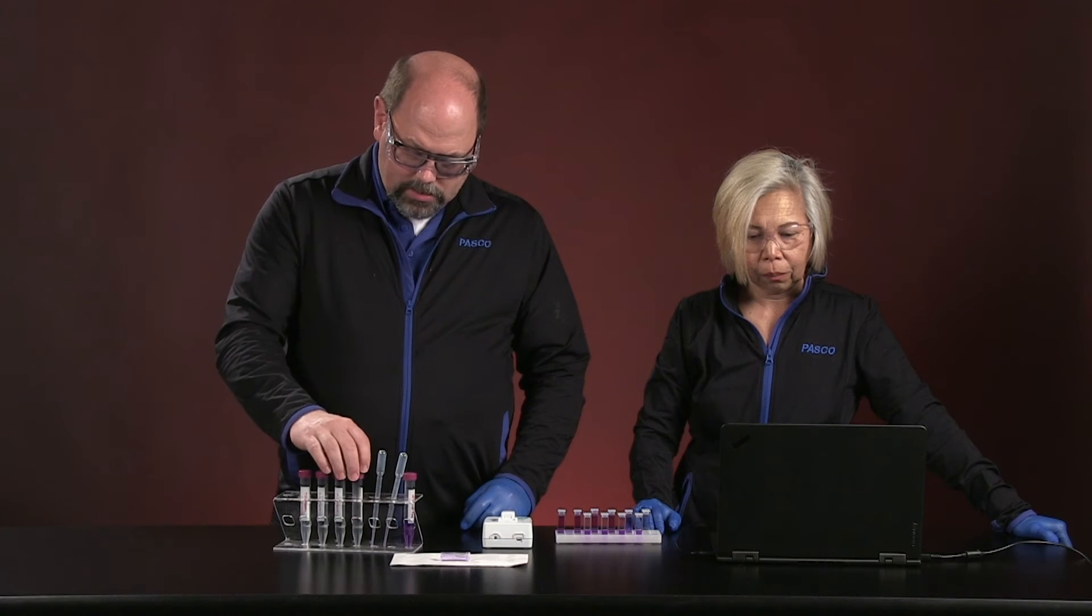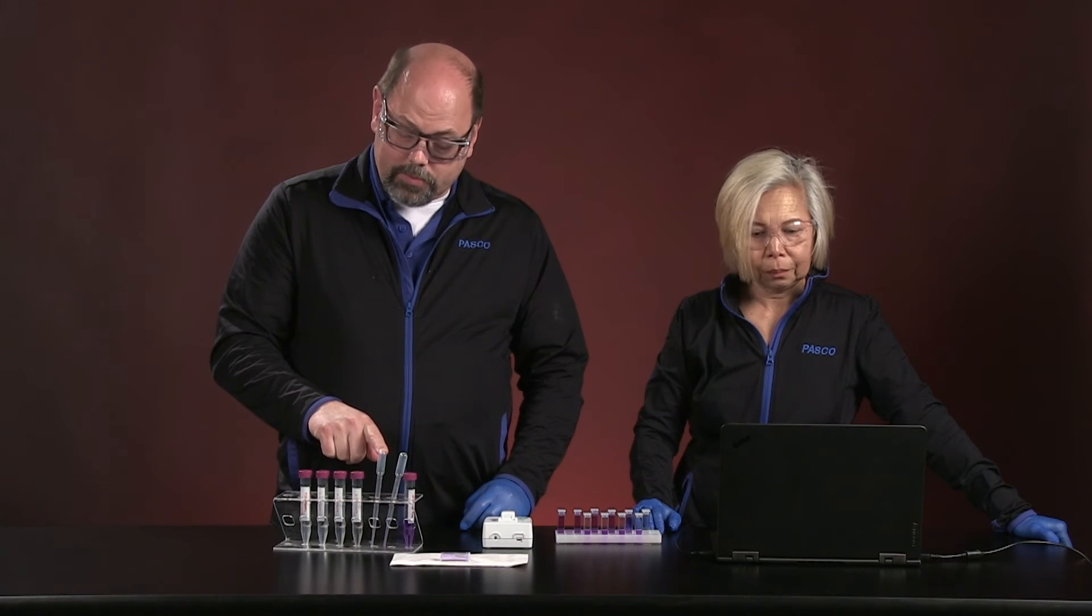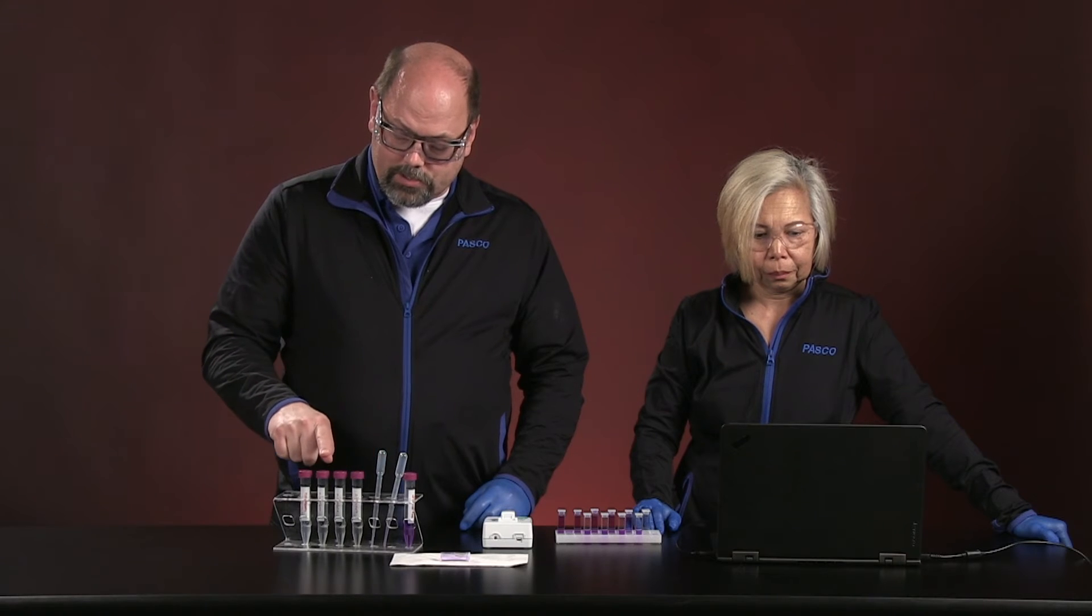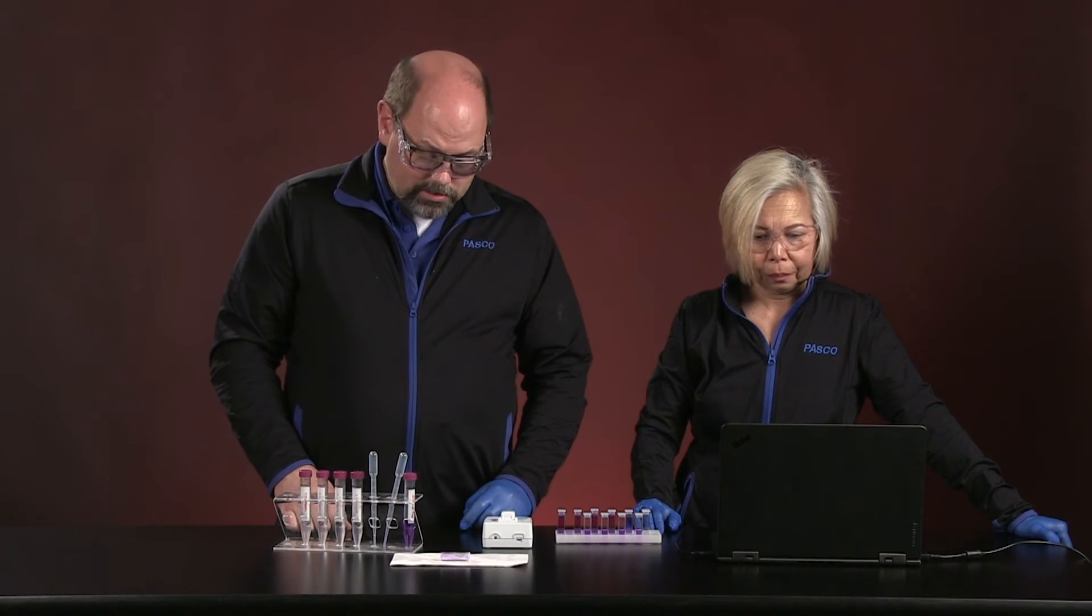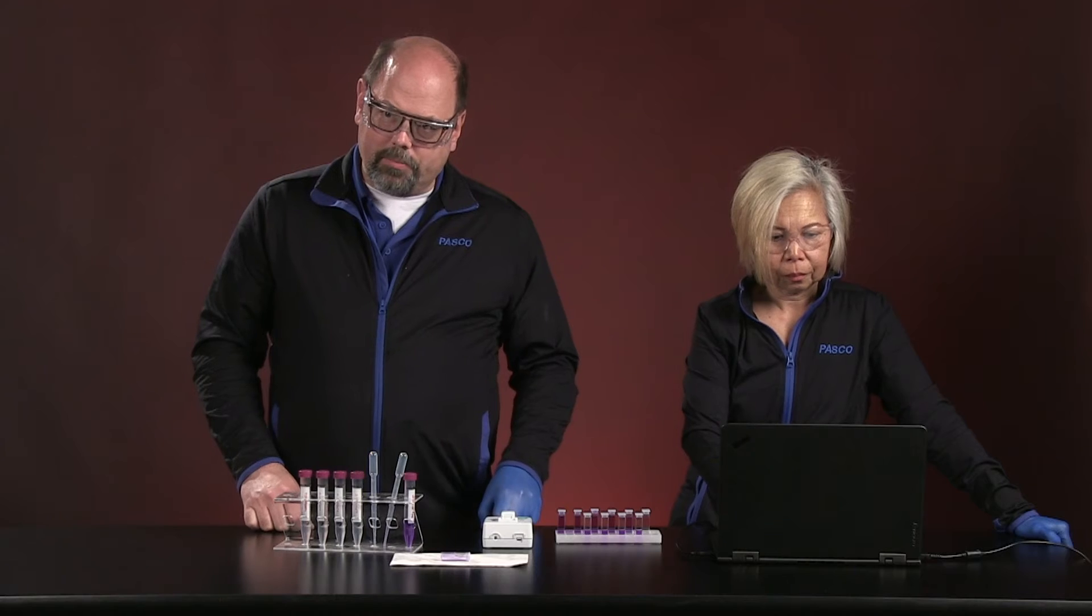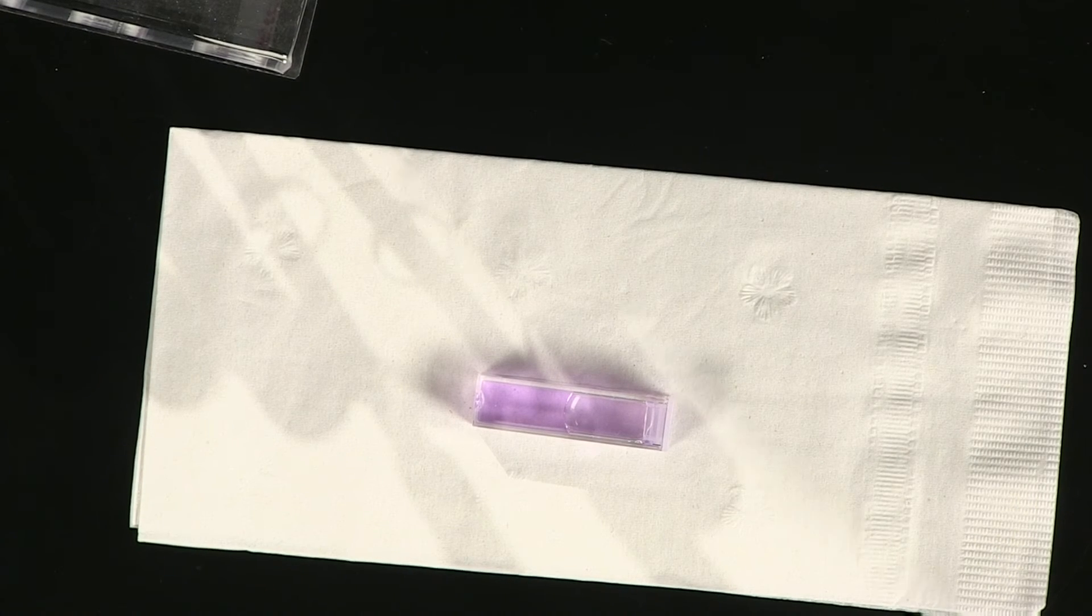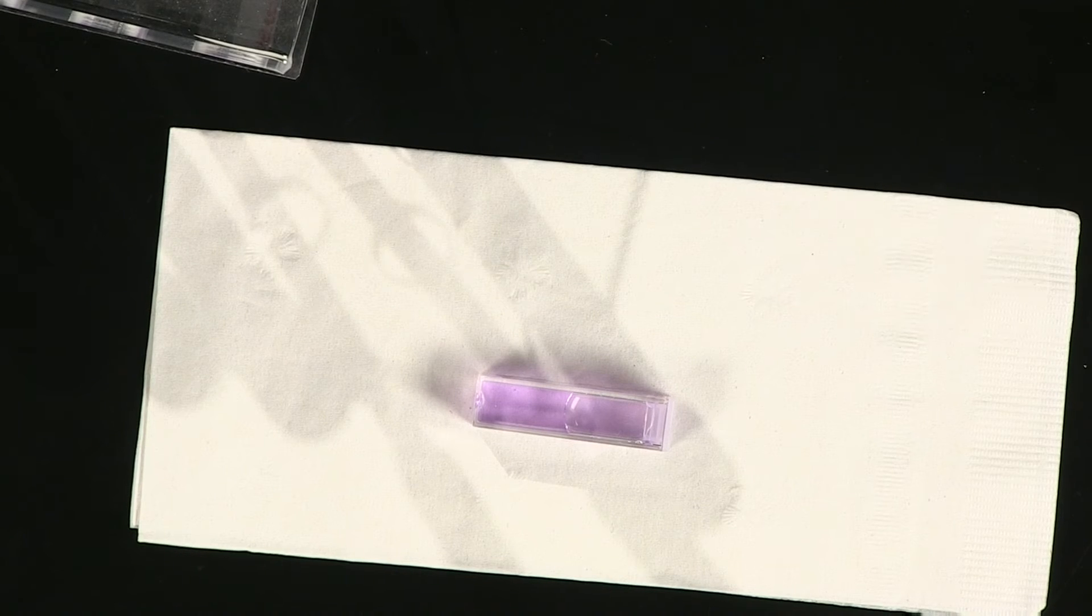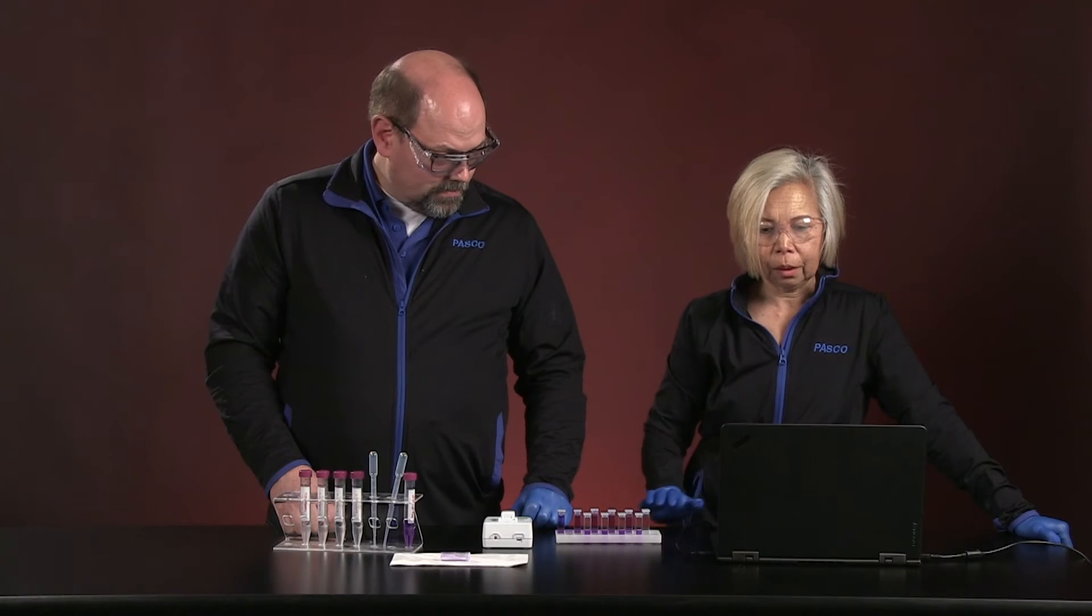Now, this is also the least concentrated because we're using an eyedropper that I can't clean between times for the film's purposes. We're going to go to more concentrated and more concentrated, which should leave the least amount of error as I go up concentration. So we're going to let this go about a hundred seconds. And this may take two or three of our experiments to see finally it change, but we've put the least concentrated sodium hydroxide into that one. I think it's getting less visible when we mix the next one. Slope there. Yeah, there we go.